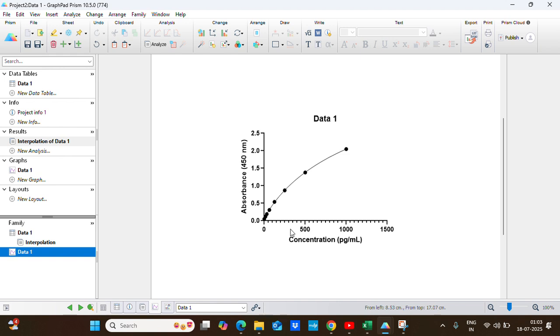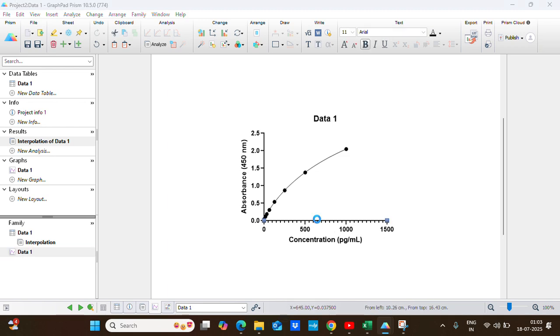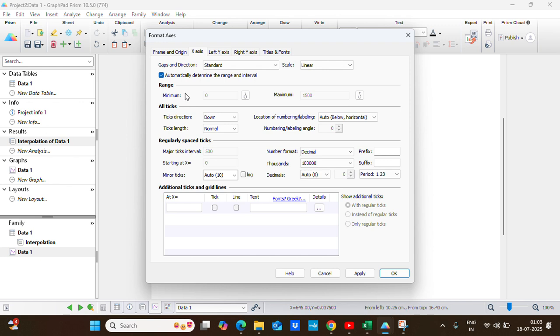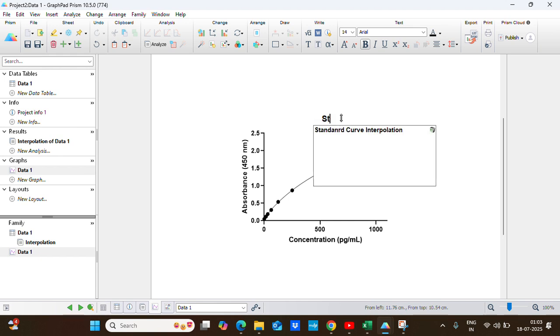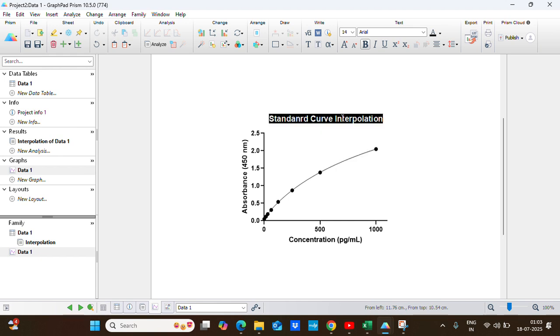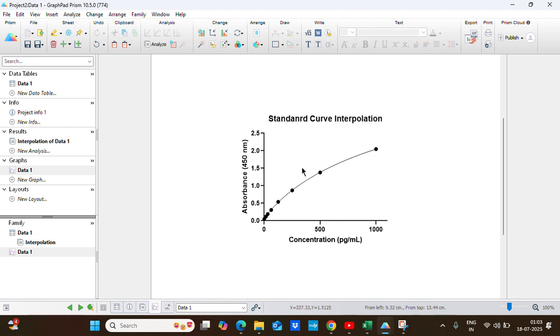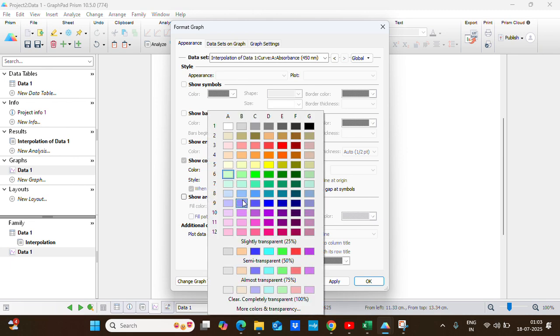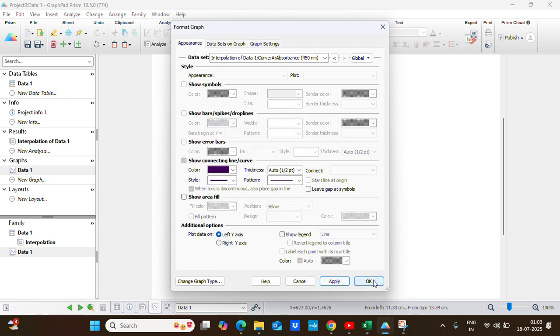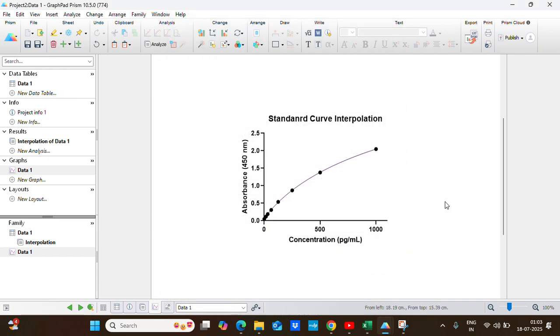We will do some editing and formatting. I will change the X-axis scale. I will change the label to Standard Curve Interpolation. I will change the color to make it darker.